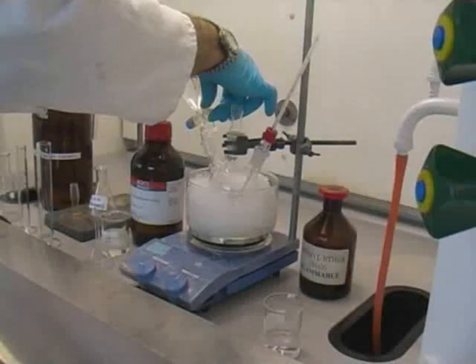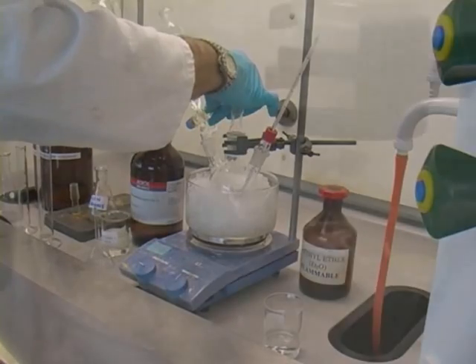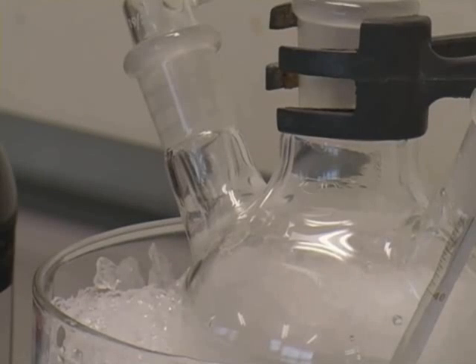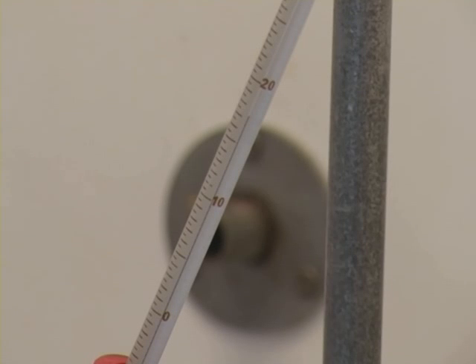Add 40ml of water to the dropping funnel and slowly add drop at a time to the round bottom flask. Do not allow the temperature to exceed 25 degrees centigrade. This procedure cannot be hurried and will take about 20 minutes.